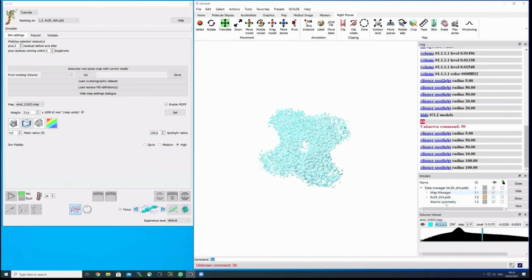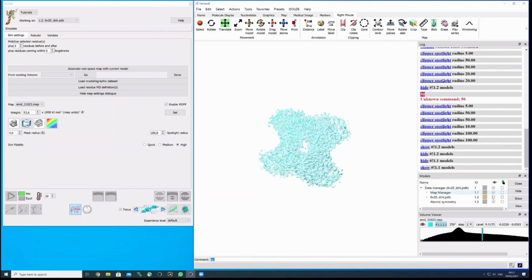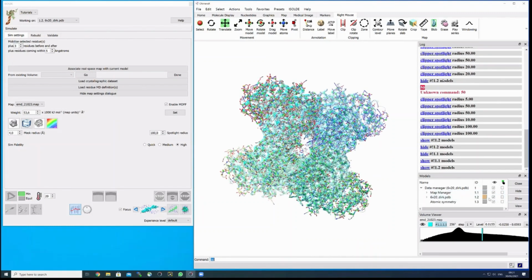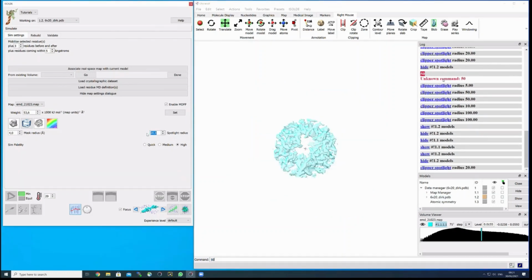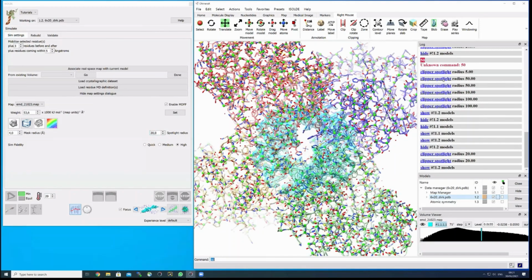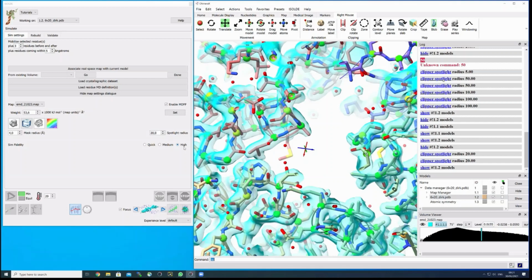I can still use the standard ChimeraX model viewer panel, where I can switch the model on and off, but I can also do this for the map. Okay, so I will now use just spotlight radius 20. Go inside, and this is one of the basic functionalities.